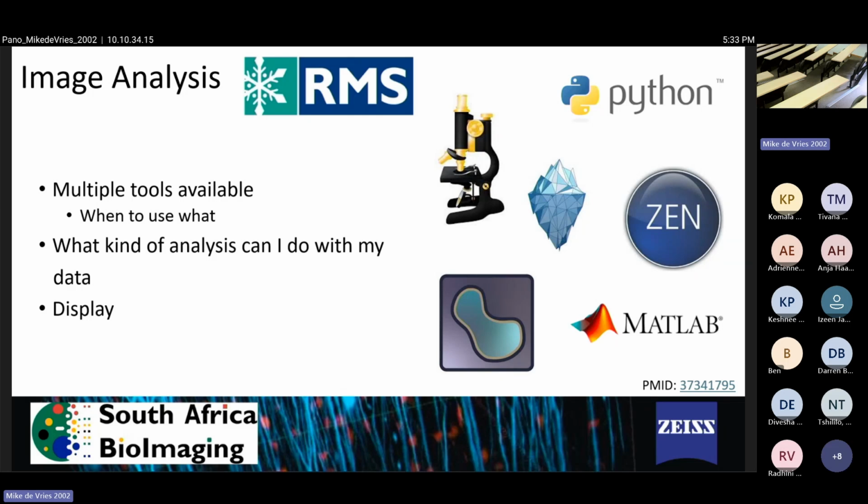I have 3 points from various things. I'll try to get through them really quickly. One is, if you haven't already, Lisa, and SABI in general, it might be worth looking into linking that protocols page to an instance on protocols.io, because that's literally where you can pay for something, but it's free. And the main distinction between the paid or the free version of protocols.io is that if it's free, you're forced to make your protocols public, which is what you want to do.